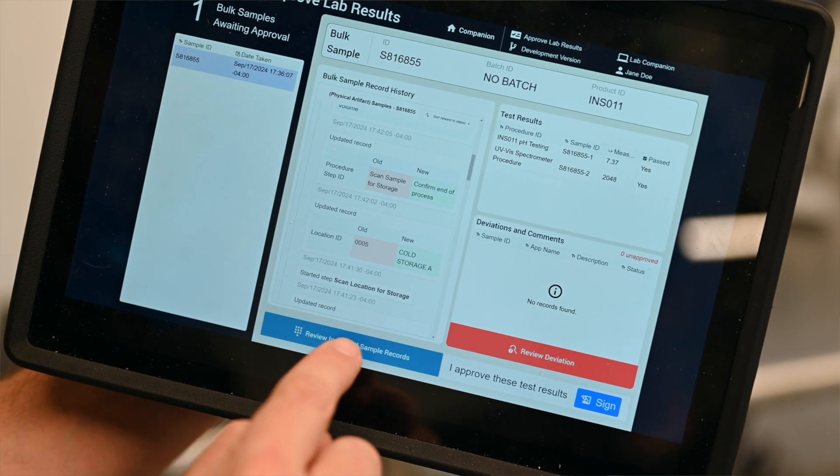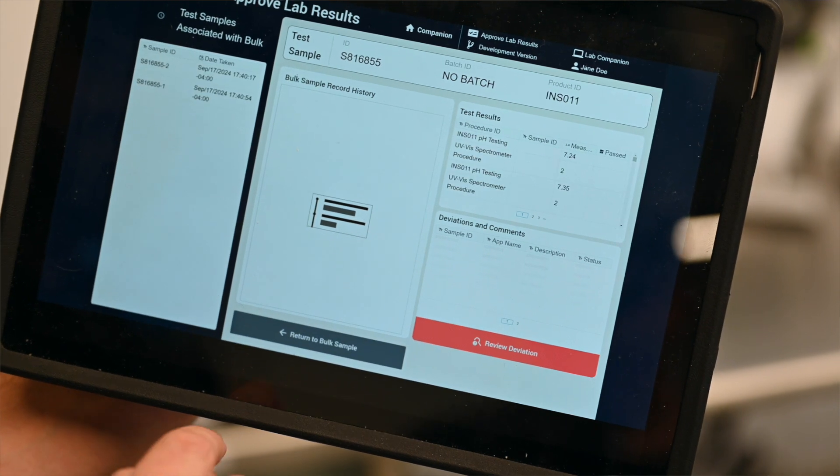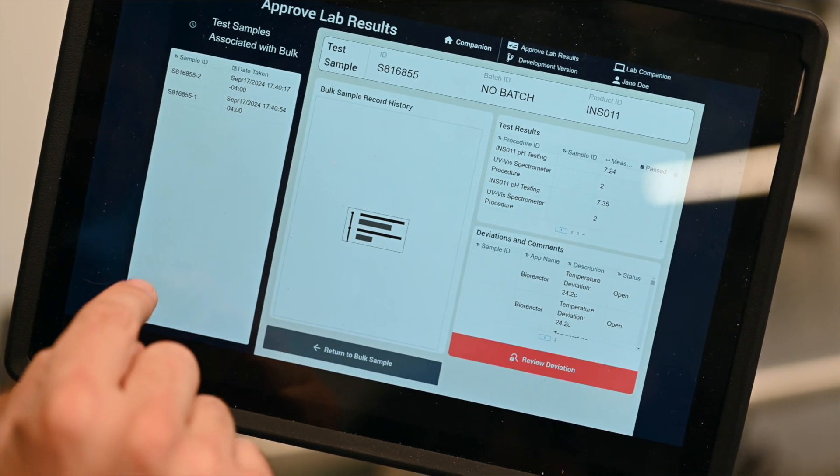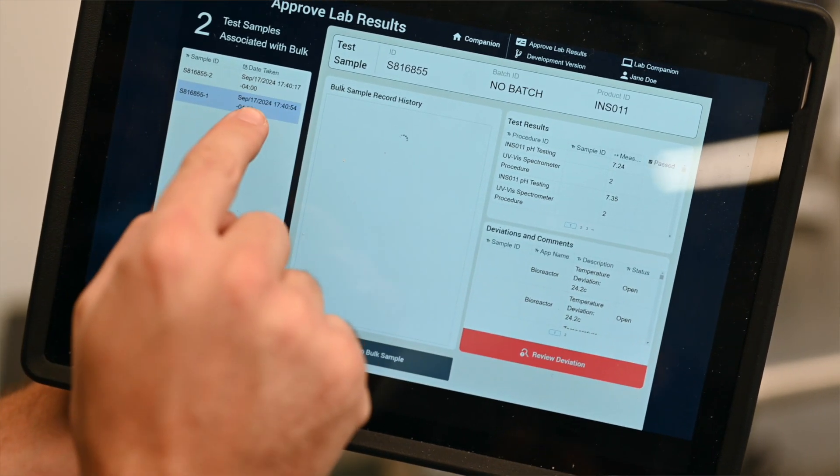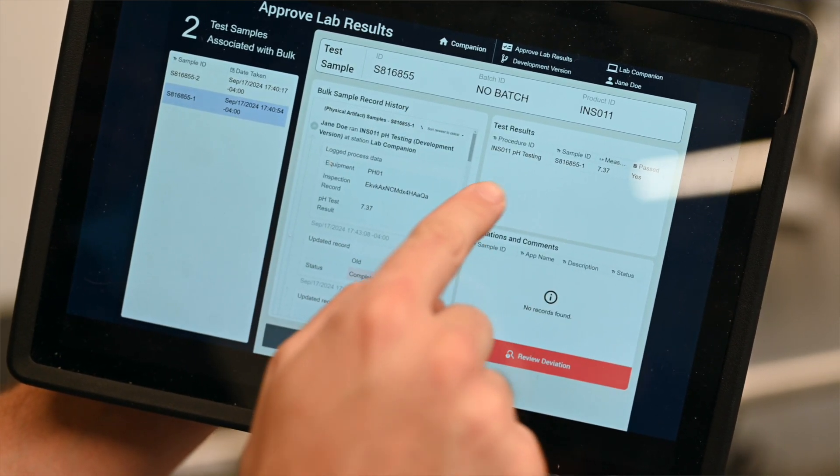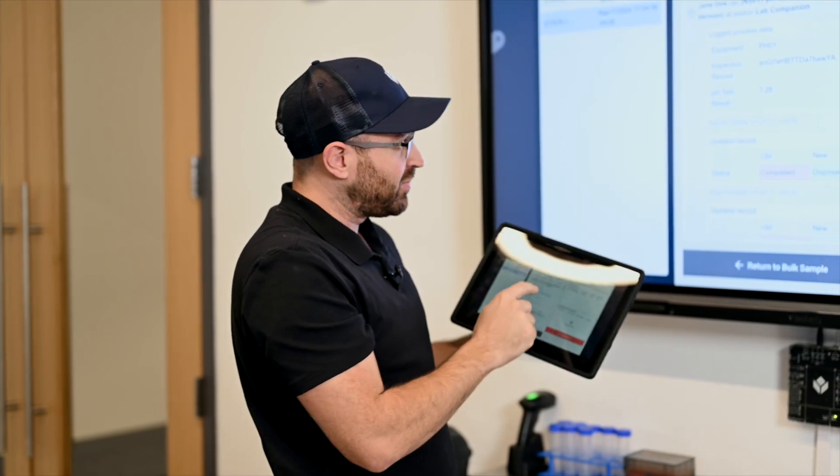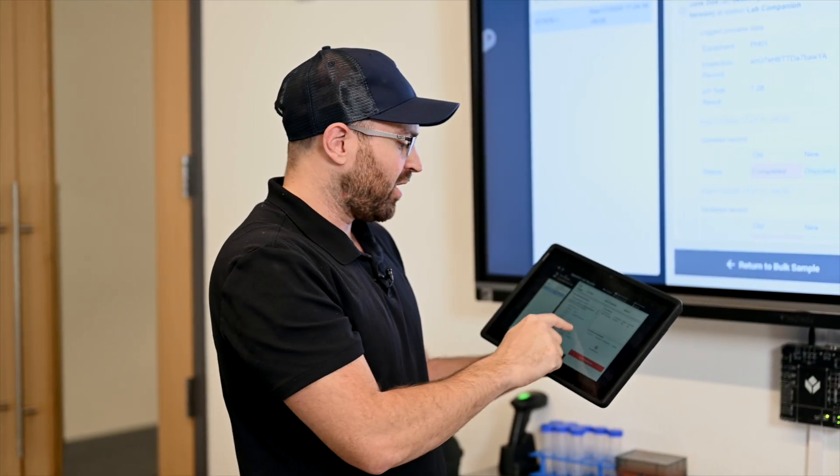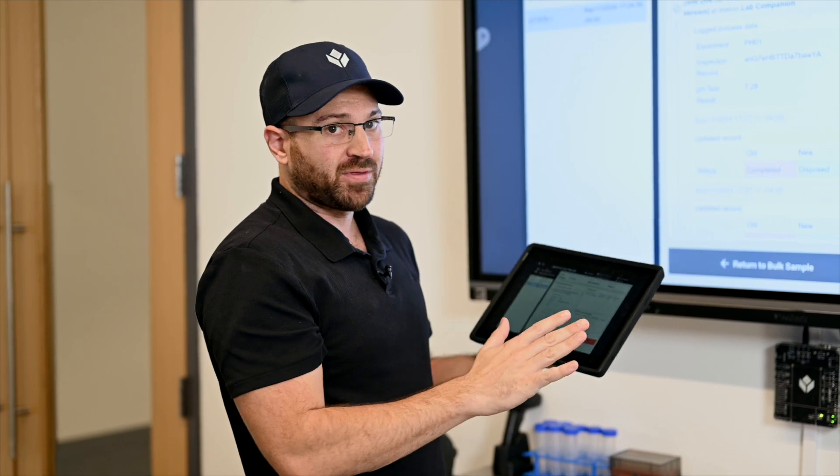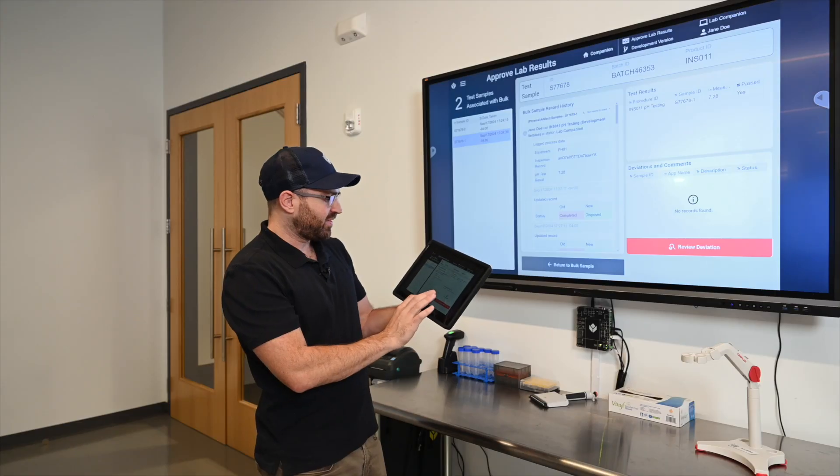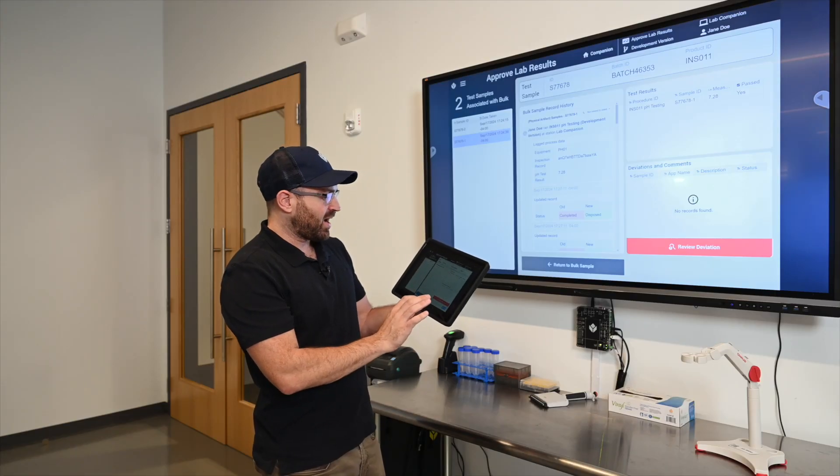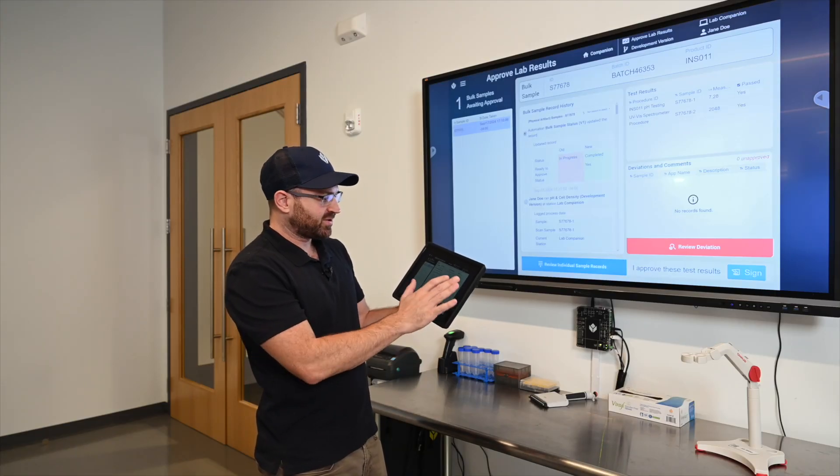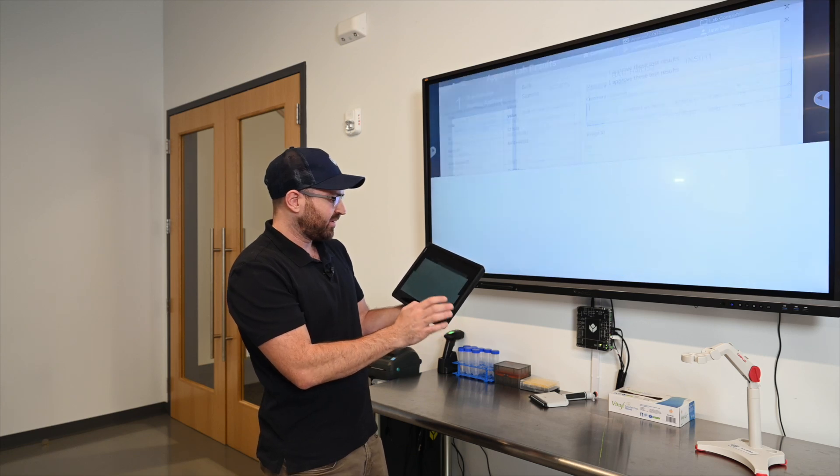If there are any deviations here we have to review those deviations and approve of those as well. I can also click on any individual sample record for that bulk and I can click on this test sample like the pH one and I can see its history. What was the inspection record? What equipment did I use? What was the status of that equipment? All this information is stored along with every record.